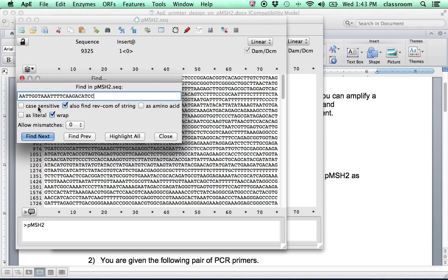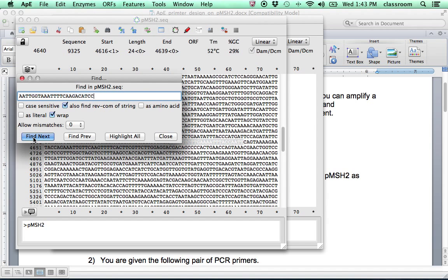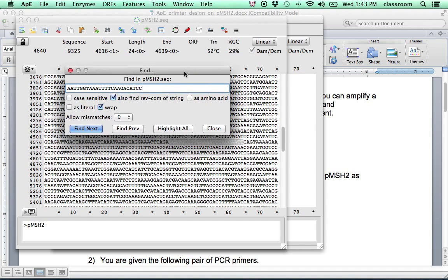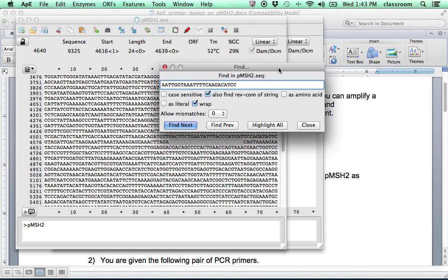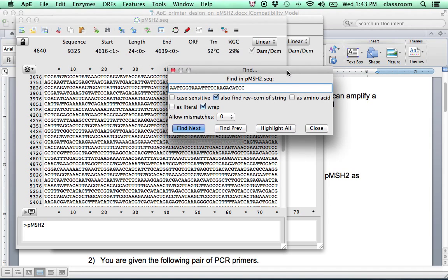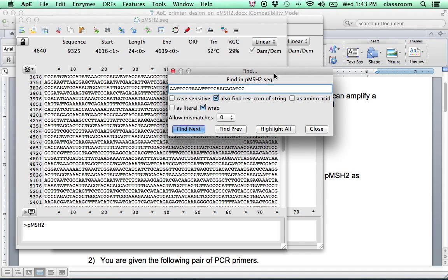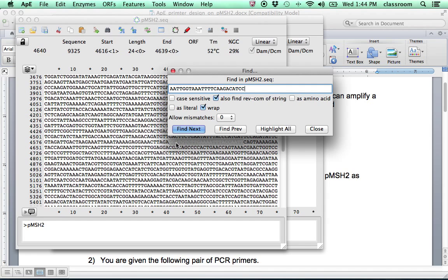And let's paste the first sequence. And make sure also find the reverse complement and the strand is checked. Usually, by default, it's checked. Then click Find Next. And you can see the sequence AATT is not here. It's actually TTAA on this side. So this is the reverse complement. This sequence is found on the reverse complementary strand of the plasmid.